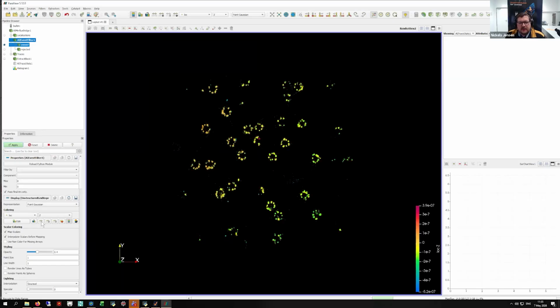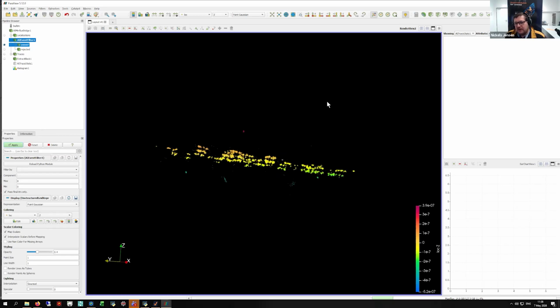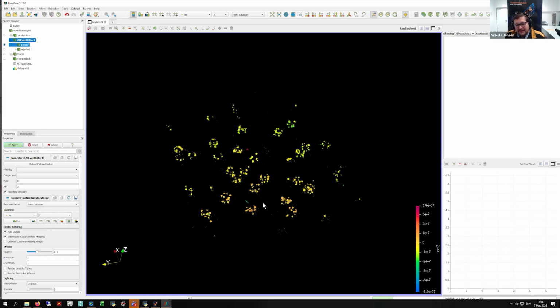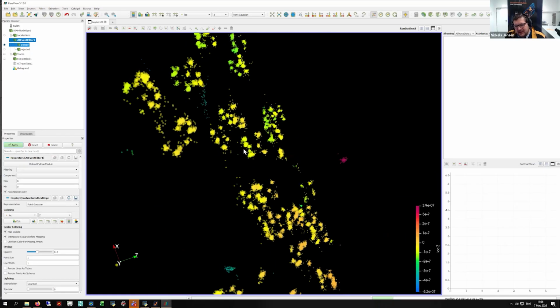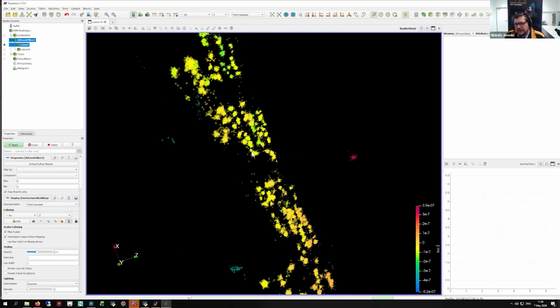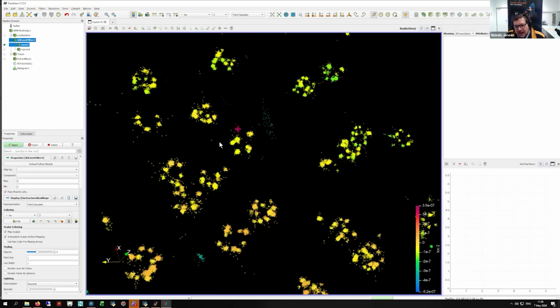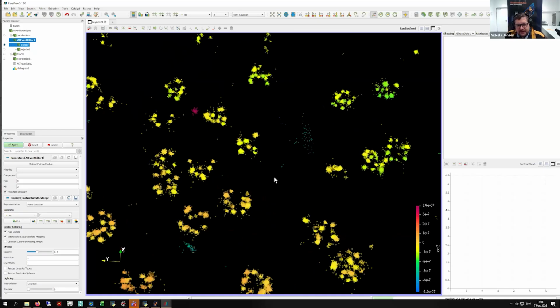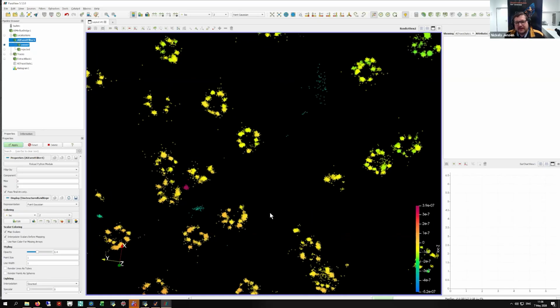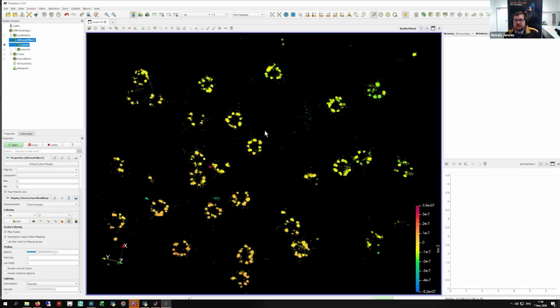And this would be now an image of nuclear pores that were measured for about an hour. And as you can see, if you move closer in, it's a clear separation between the nucleoplasmic and cytoplasmic region. And you see that the pores are quite well filled, and the localization precision, they're all separated, and you can separate all the single positions in the nuclear pore.